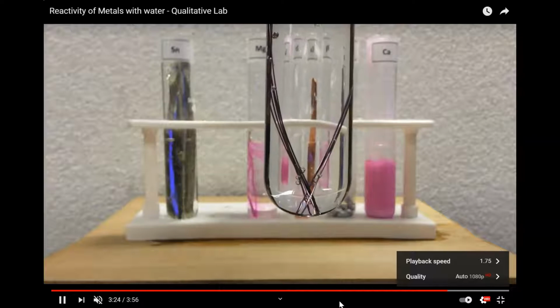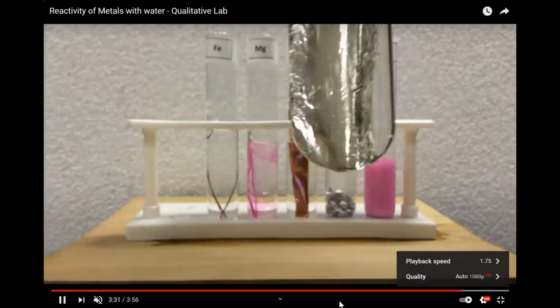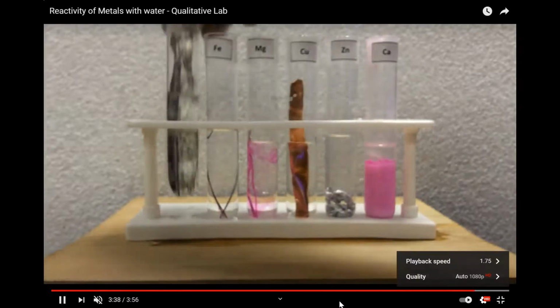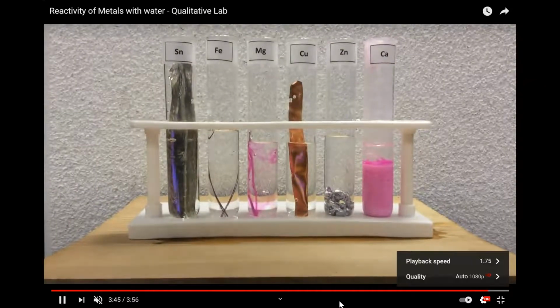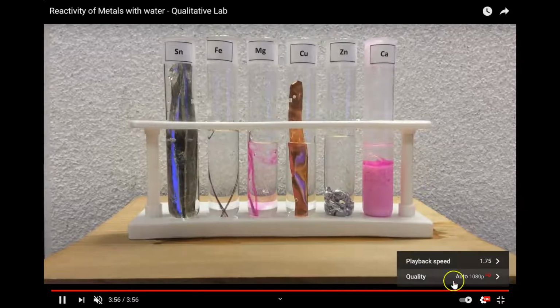Not seeing anything on the iron. I think those bubbles are just typical for when you pour a liquid into glass. You sometimes get a few bubbles. I'm going to get to see a close-up of the copper. No, that's unfortunate. It would be nice to have seen the copper. I think we're seeing a little bit of a reflection on the copper of the pink from the magnesium. All right, so that's that.